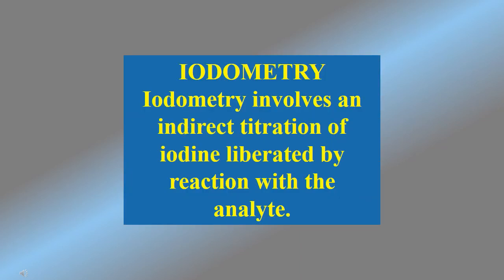Now let us proceed to Iodometry. Let's not forget that even in Iodometry we'll be using the same set of reagents, which include iodine solution, sodium thiosulphate, and our starch indicator. What is Iodometry? Iodometry involves an indirect titration of iodine liberated by a reaction with the analytes.